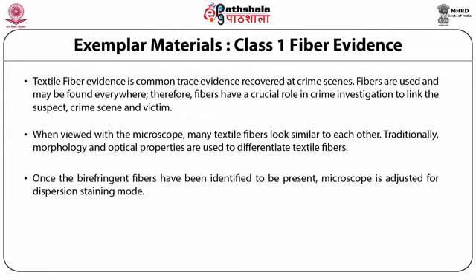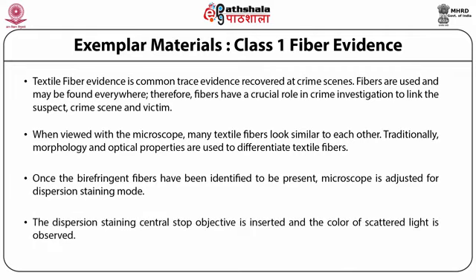Once the birefringent fibers have been identified to be present, the microscope is adjusted for dispersion staining mode. The dispersion staining central stop objective is inserted and the color of the scattered light is observed.